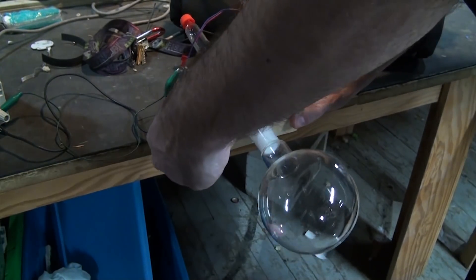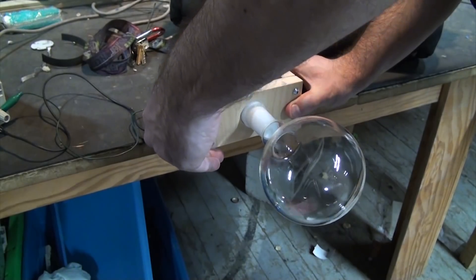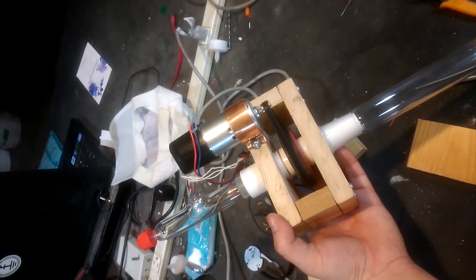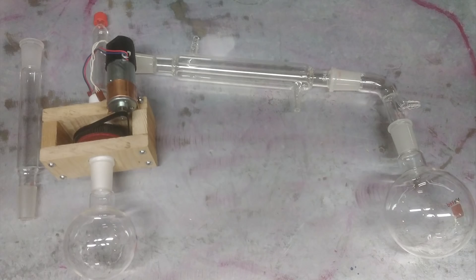Off camera I'll attach some hardware to the side to allow this to be mounted onto a retort stand, and also build a couple of stands to hold the whole system. And that's pretty much all there is to it. Like I said at the beginning, I'll go through the rest of the system when we get to it, but this is by far the most challenging part of the whole thing. I'm super pleased with how this turned out, and I think it actually looks really professional.